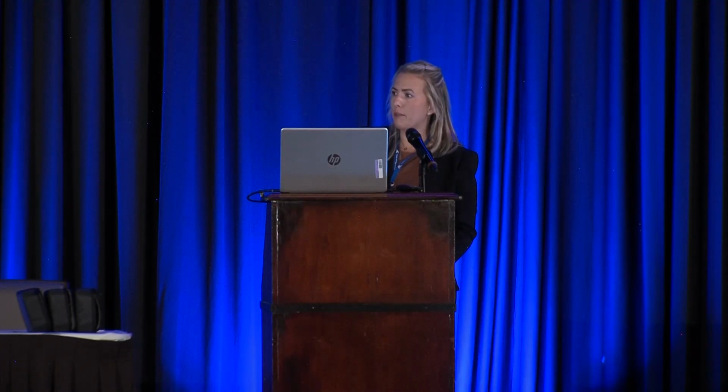If you want to be informed that it's new and it's not been in the library, then this information will be displayed in your SCADA system. So it's an open software what to program there. But if it doesn't know it, then it doesn't know it. It could be because we really want to verify it is the product that we expect it to be. It's not an unknown identification. It could be set up that way. It's probably more handheld or benchtop Raman, but this sensor type is for, is it the product, yes or no?